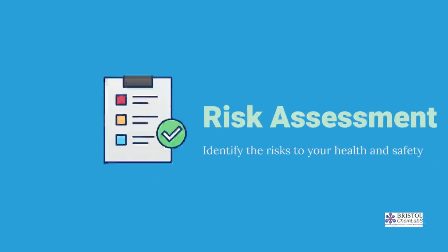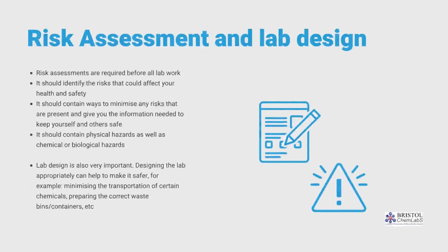Let's briefly cover risk assessments. Risk assessments are required before all lab work. A risk assessment should identify the risks that could affect your health and safety and should contain ways to minimize any risks that are present. This in turn should give you the information needed to keep yourself and others safe. It should contain physical hazards as well as chemical or biological hazards.